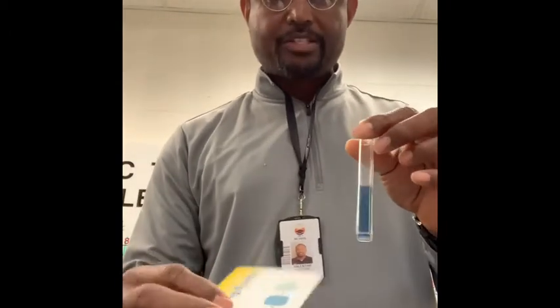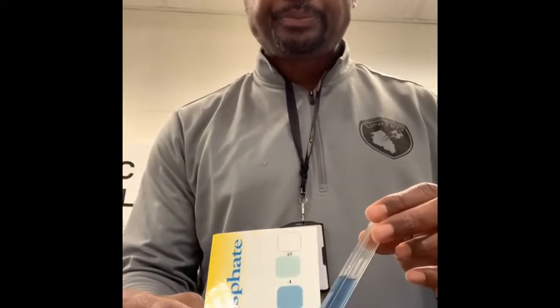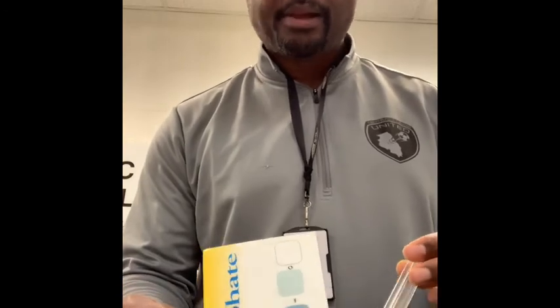Okay, so our test results for our phosphate test. This is our color. We match it to our chart, and our phosphate level is around 4 milligrams per liter. So 4 milligrams per liter is our phosphate level as matched with that dark blue indicator.